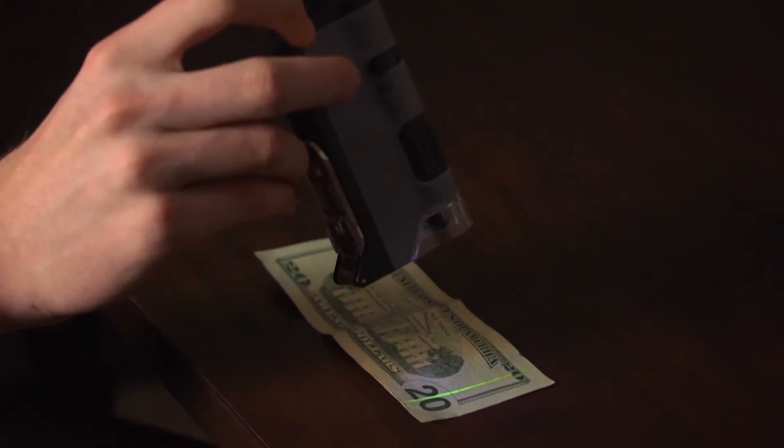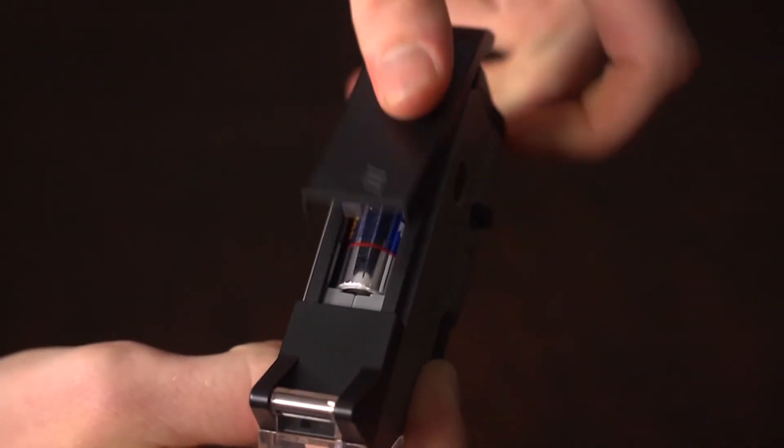Built into the body is a cool UV light that will allow you to see things like hidden print on currency. The MicroFlip uses one AA battery.